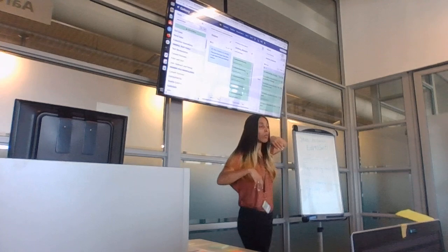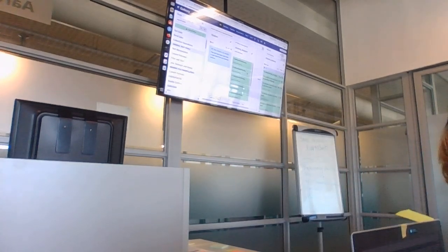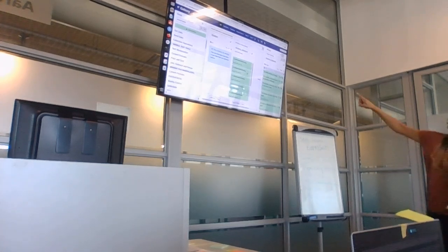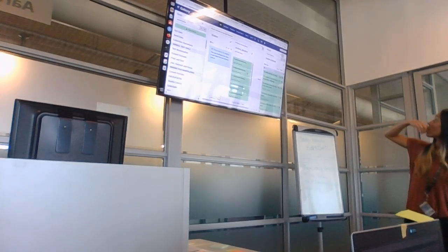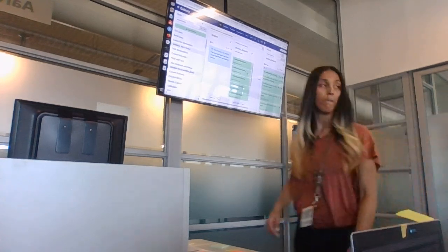You can now, Dafa, are you following? You want me to explain what is happening? No. The file I downloaded first is not giving the same name as the one that I'm downloading through the link pasted. So it's like two different. You see, the first one was this. And this one.